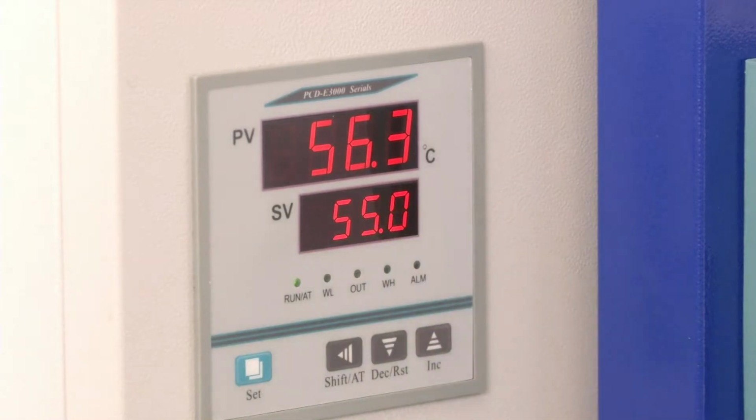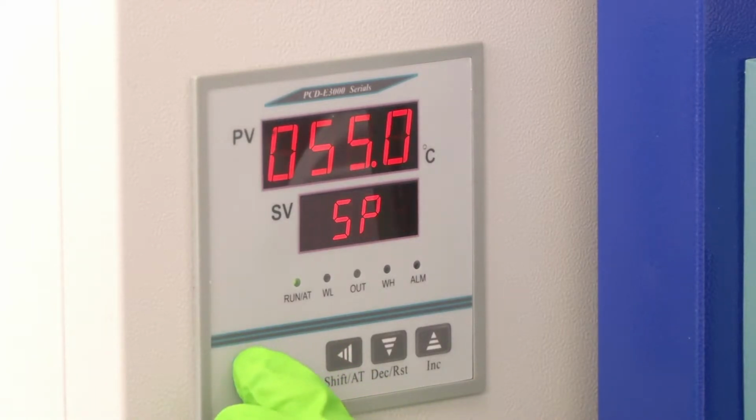SV is set value, PV is present value. Because we had closed it at that temperature, it has already ramped up to that temperature. Now because the temperature is higher, as you can see, it will slowly settle down to a lower temperature, that is the set value. This will take some time, as the control system has to sense the present temperature, make a decision after comparing it with the set value, and then reduce the temperature. Over time this will settle back to 55. Now let us say we increase it to 70 degrees Celsius.